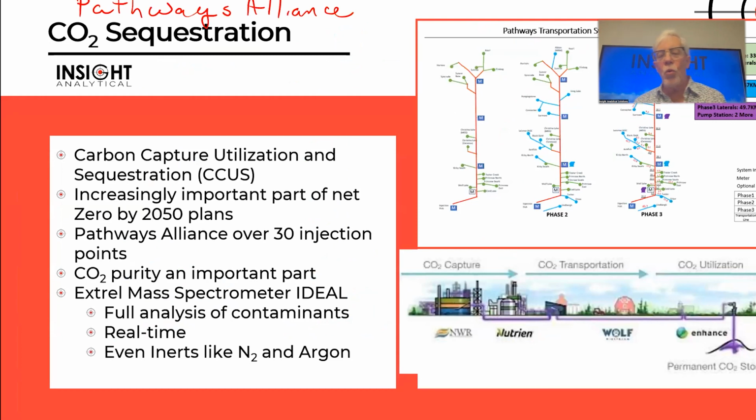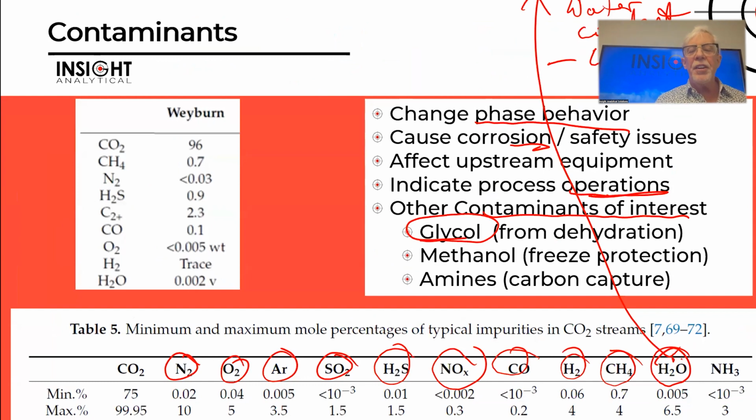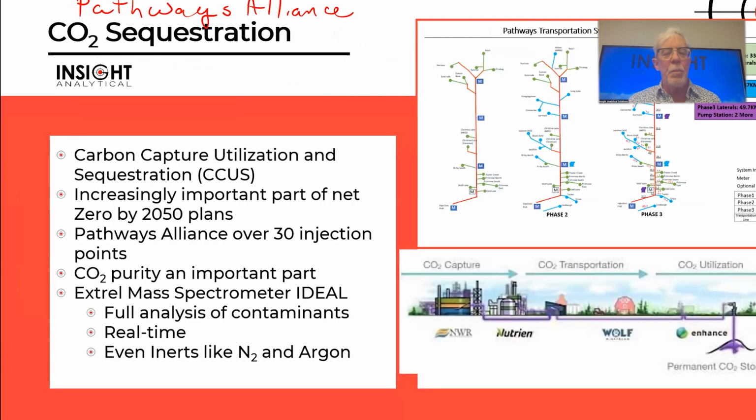And so because we've got a lot of components that we would like to be able to measure, if you look back at that previous slide, we talked about a lot of different chemicals we would like to be able to do an analysis for. And so in an ideal world, we would prefer not to have to put an individual analyzer in for every component. And so because of that, mass spectrometers become one of the ideal solutions for this.